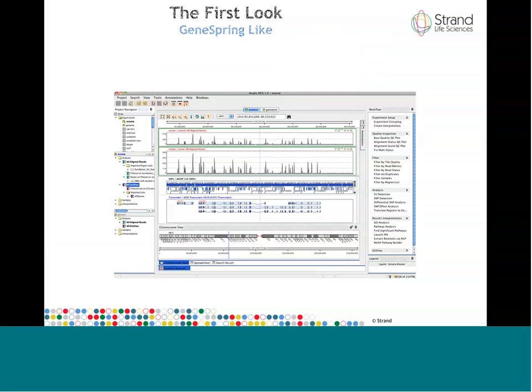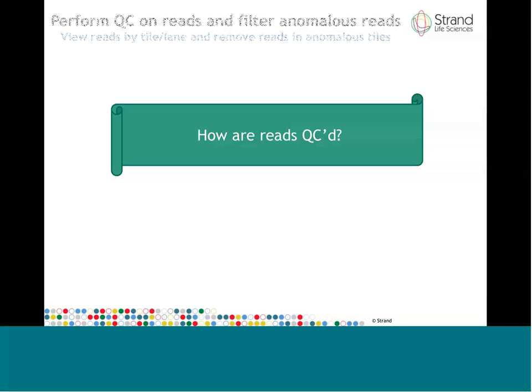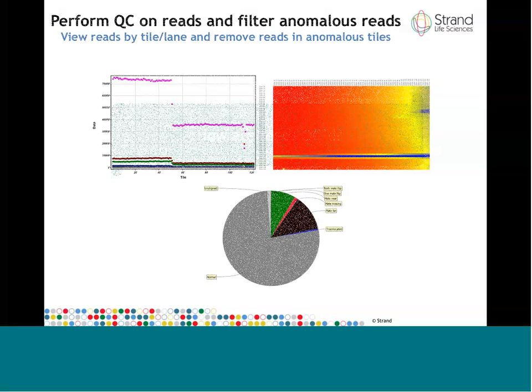Okay, now that we've imported in our samples and we're familiar with the user interface, let's go through the workflow of standard collection of steps that we would run while going through a DNA-Seq experiment. So the very first step is to QC the reads and identify bad reads and filter these out. There are many ways to look at the quality of the reads, and I'll walk you through a few of these.